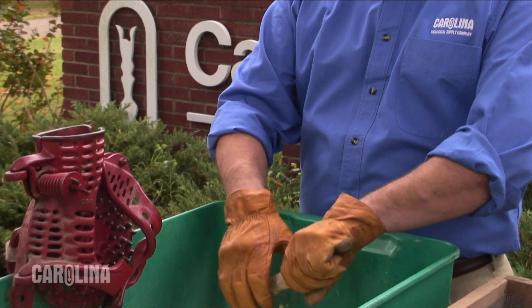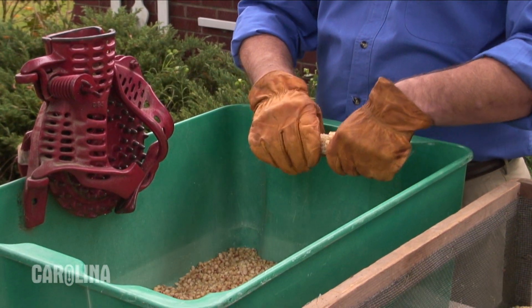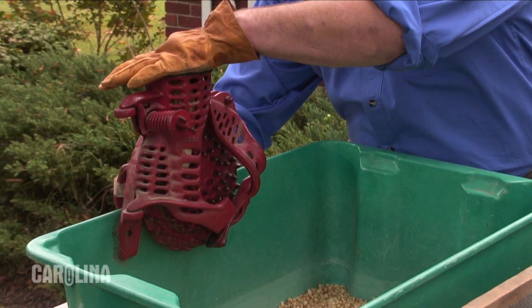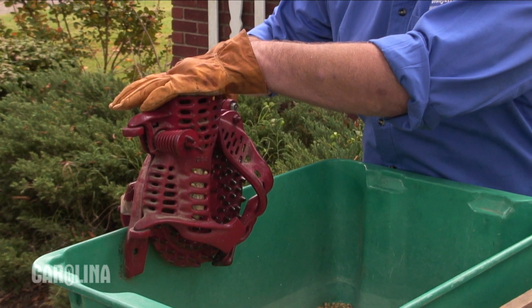The next step is removing the kernels from the cob. This can be done by hand, but as you can see, it can take quite a while and be very tedious. So we do have a mechanism here that allows us to do it much more quickly without damaging the kernels.